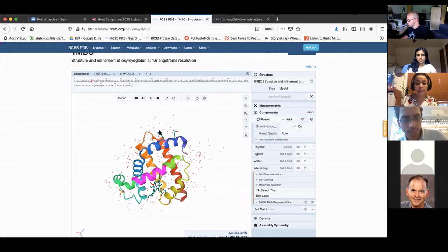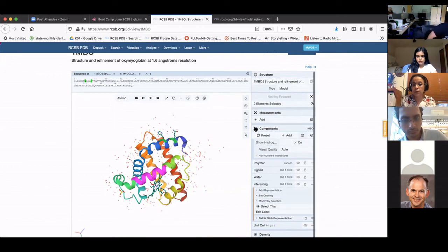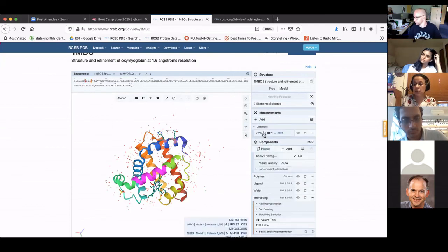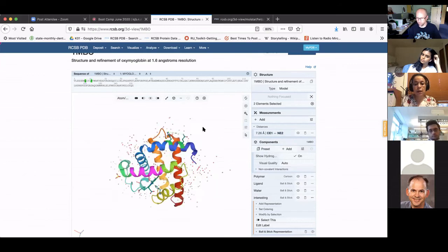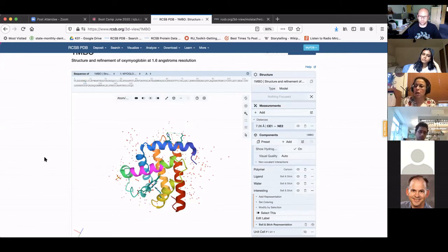then I can select that atom and that atom, sorry. And go to measurements. And notice these 2 atoms are selected. I say, show me the distance. And it computed the distance to be 7.26, okay? So I think with this introduction, I feel like I've sort of introduced the key areas and key functions here.